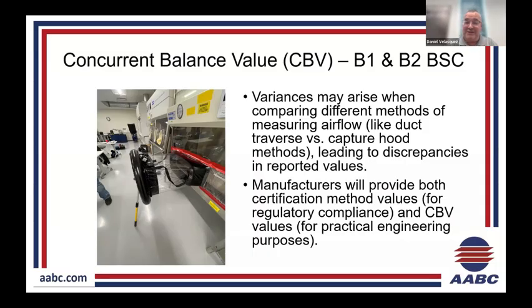A good point of this, though, is that when they test these at the factory, they will not use back pressure compensation on the exhaust side. They'll actually take the flaps out. I talked to an engineer at a bio cabinet manufacturer one time who referred to them as speed bumps. He says, we take those speed bumps right out of there. So it's definitely different. It leads to a lot of gray areas.